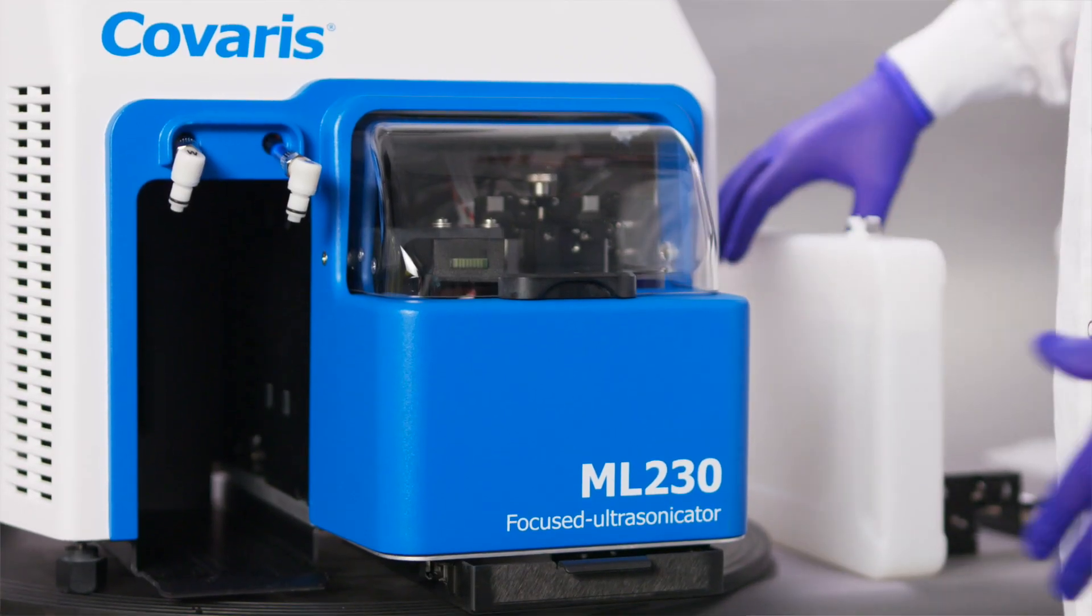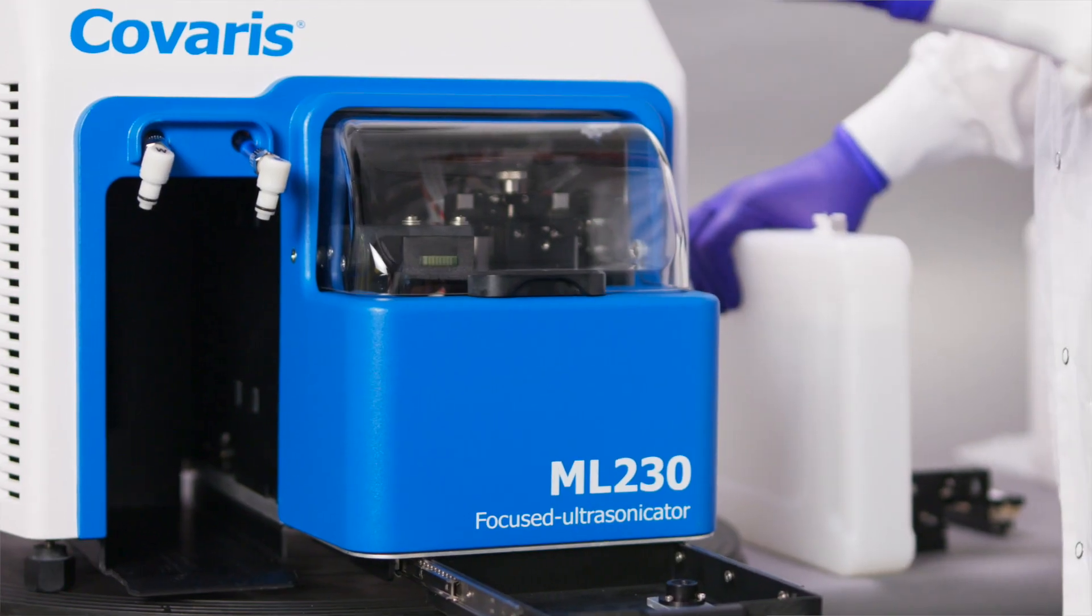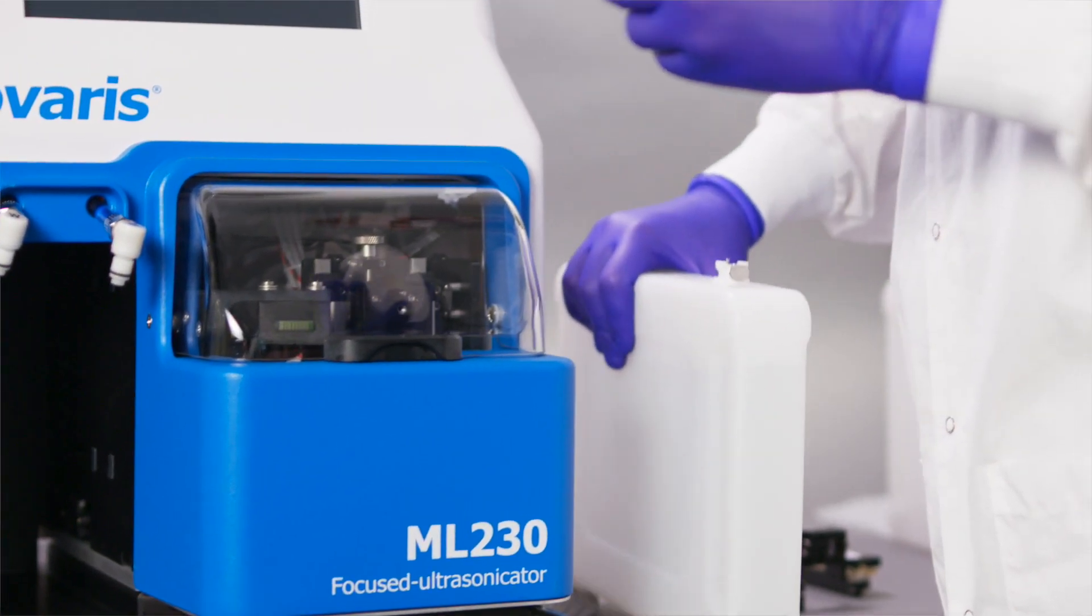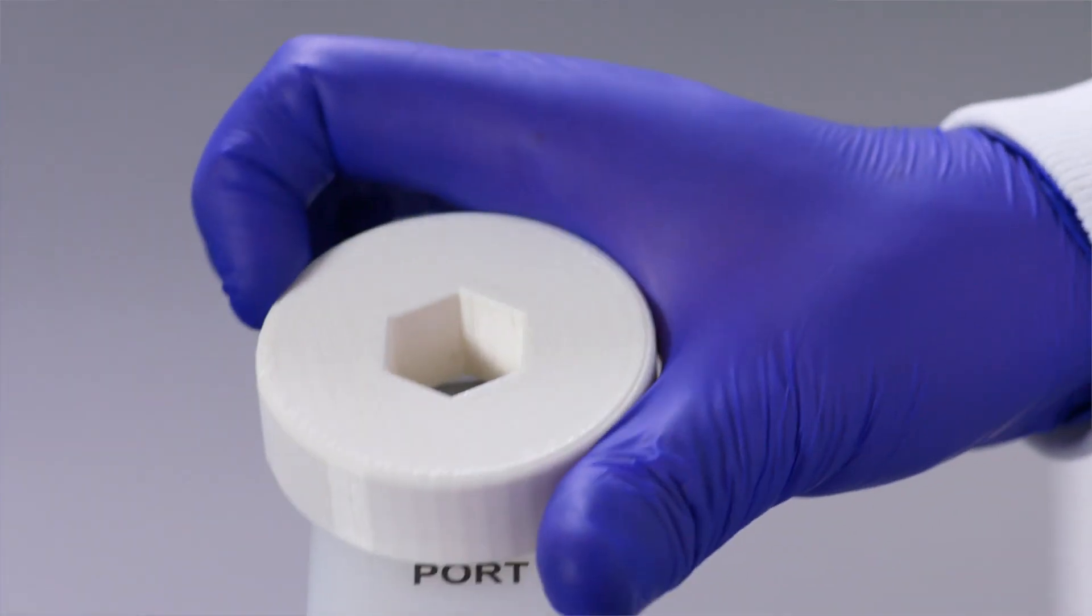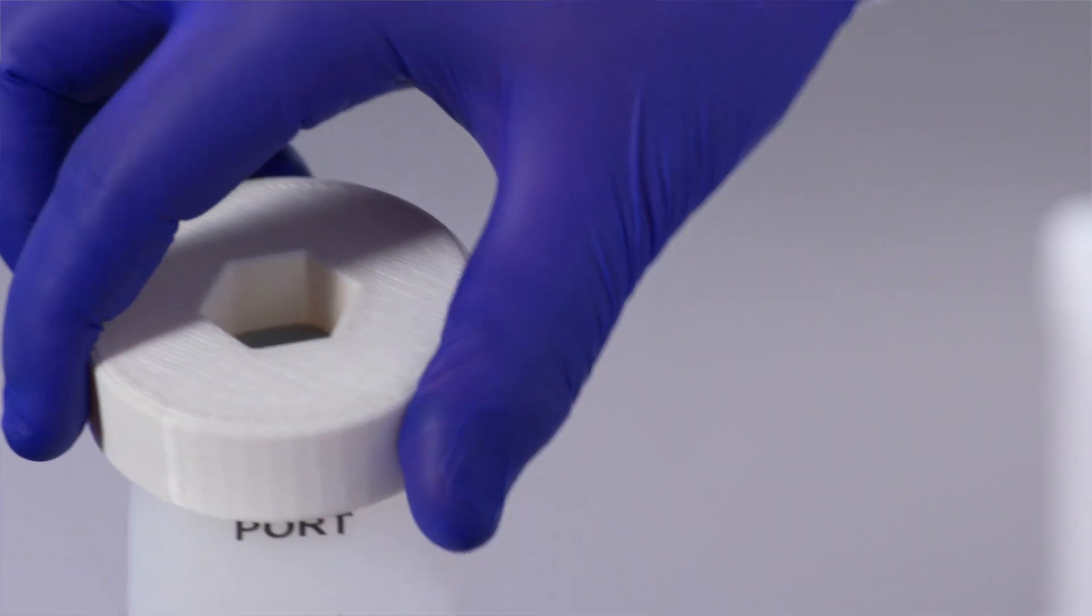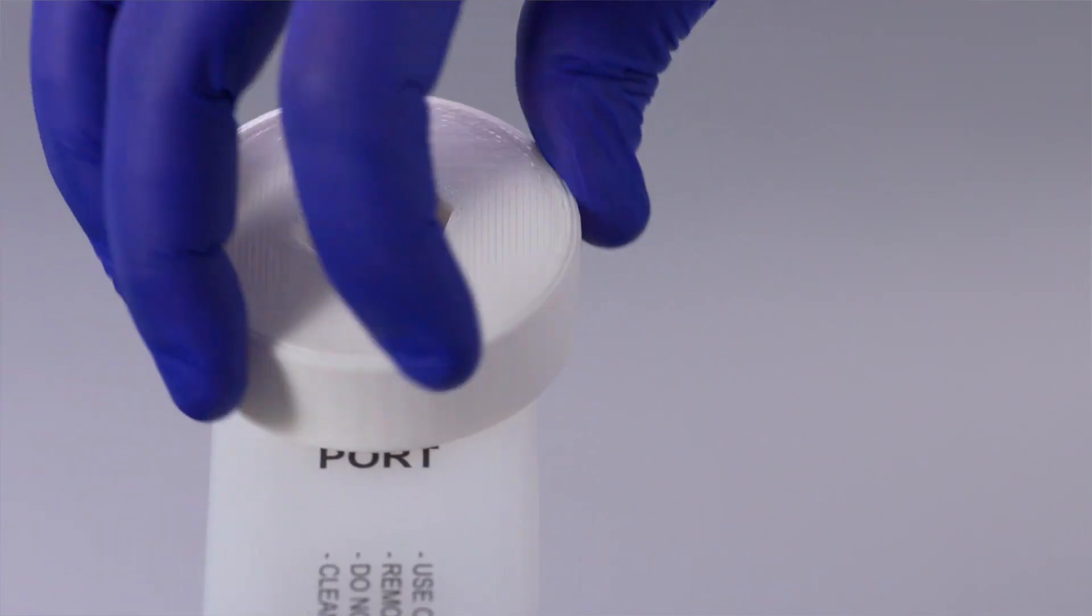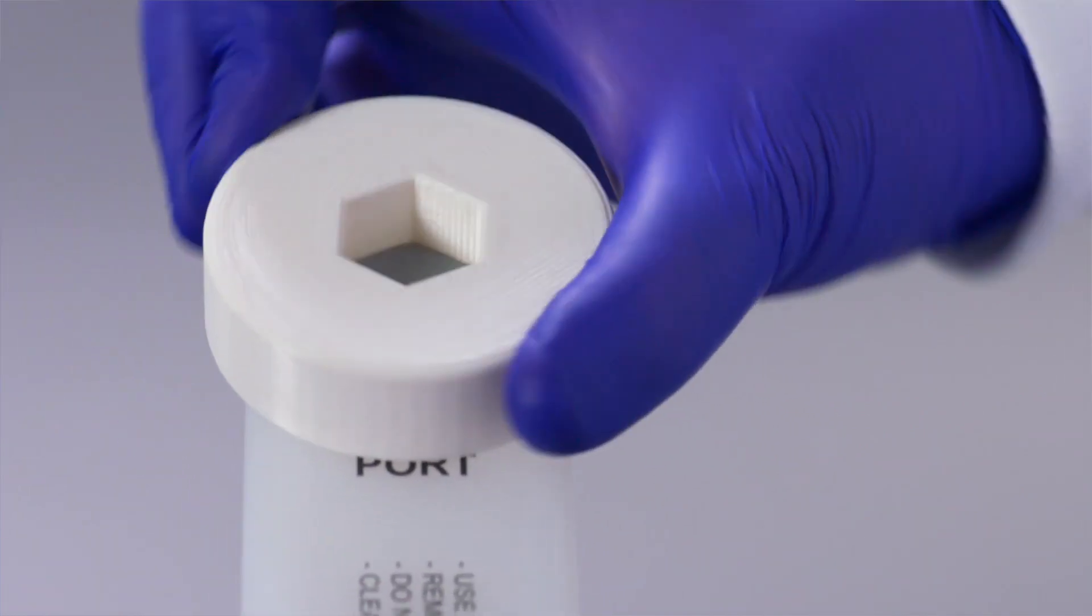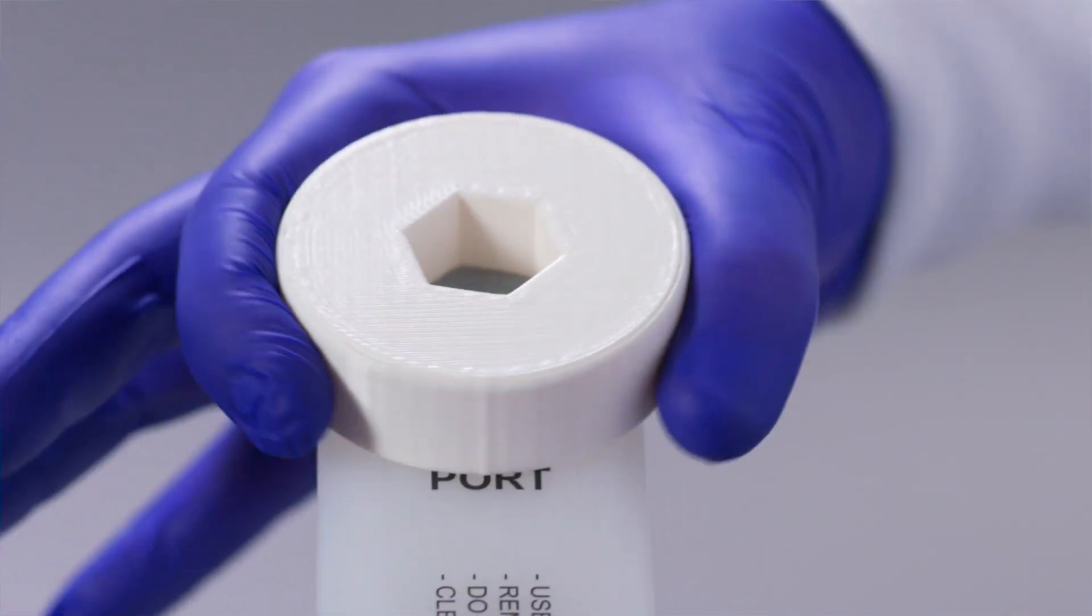Locate the two plastic bottles and the bottle cap tool in the accessory drawer. Remove the vented cap on the supply bottle using the cap wrench and fill the bottle with AFA-grade water. Replace the cap using the cap wrench. Do not over-tighten the cap. The caps for waste and supply are not interchangeable.